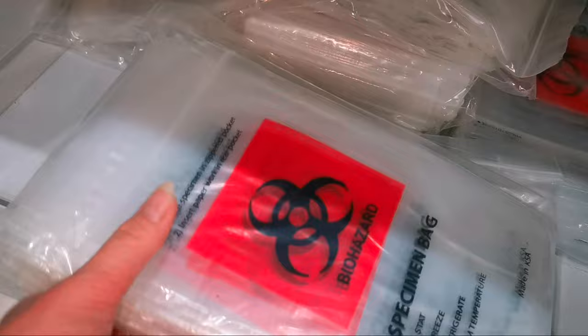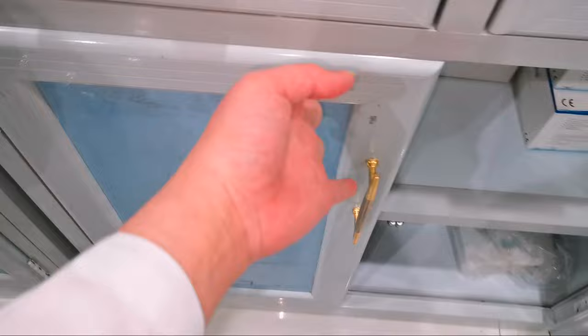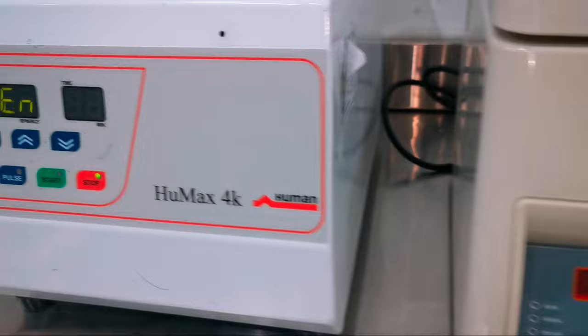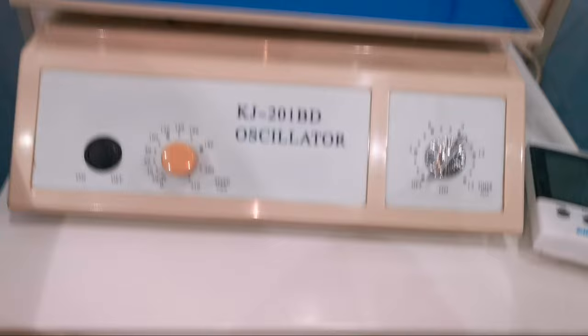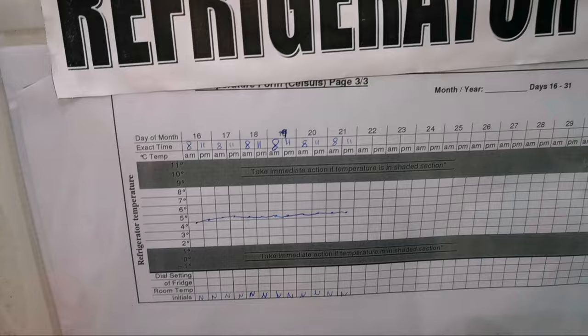Specimen bags. This is the centrifuge area. We use the centrifuge for the separation of fluids, gas or liquid based on density. We use it to spin body fluids. Microscope and another non-bio bin. A small refrigerator for some reagents, mechanical rotator.